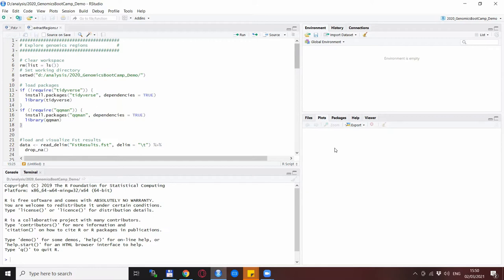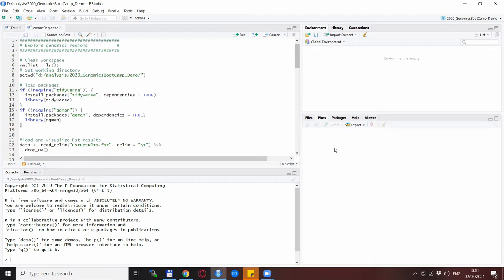Of course the manual method becomes unfeasible very quickly if you need to explore a lot of genomic regions. Therefore the automated method is somewhat more preferable, at least to extract the gene names for the regions that you are interested in. But anyway I will show you both methods in this video.